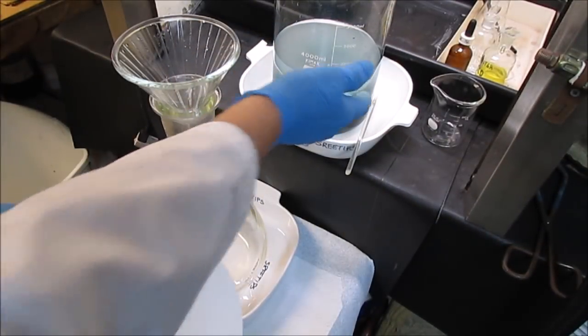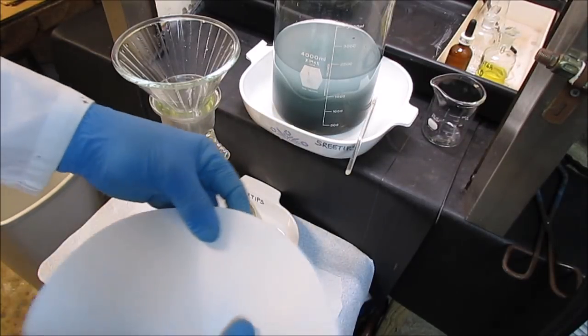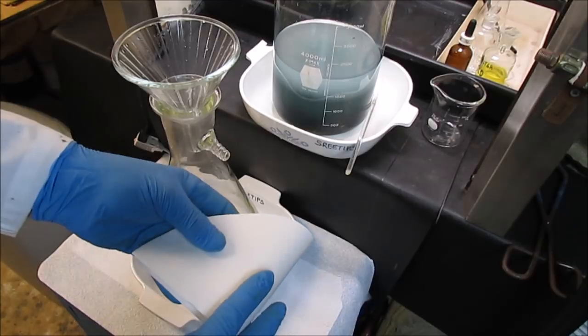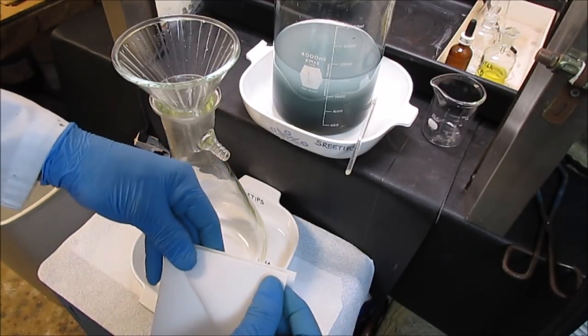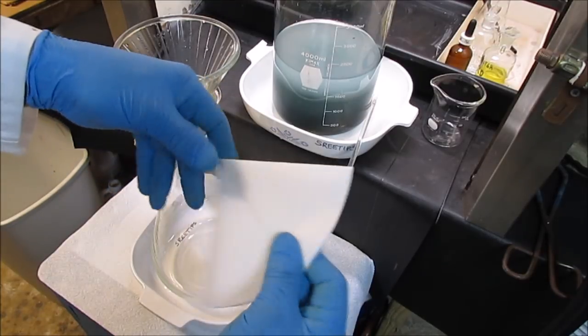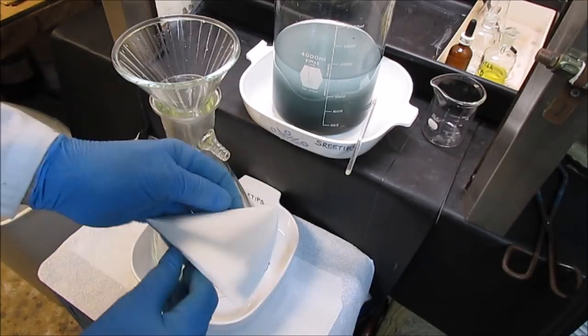Filter the contents out of this beaker over here. I'm going to use a fluted filter paper, which is we just fold it like a paper airplane a few times back and forth. And what it does is it increases the surface area of the filter so that the liquid runs through faster.